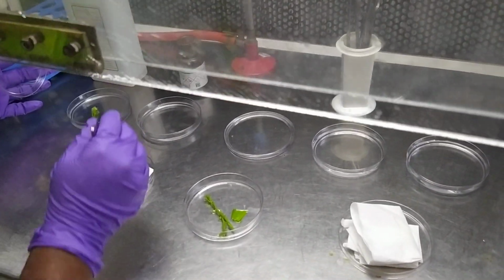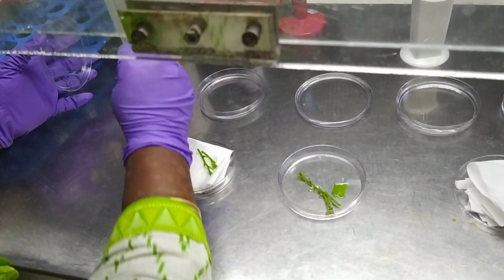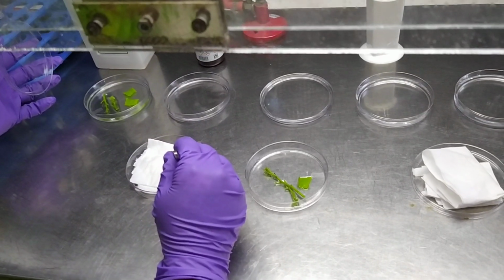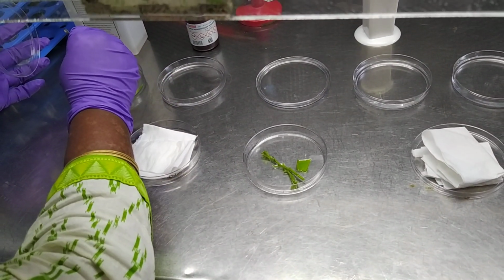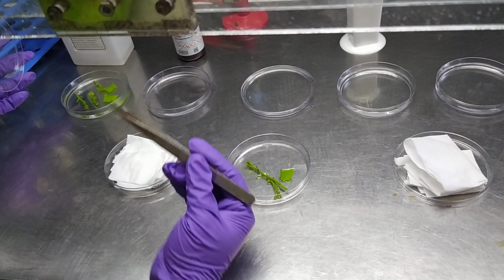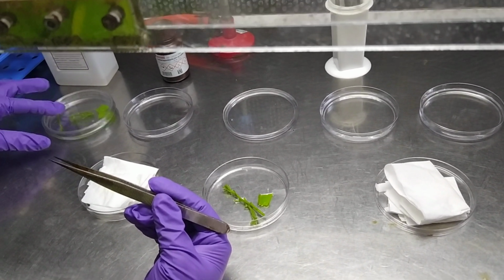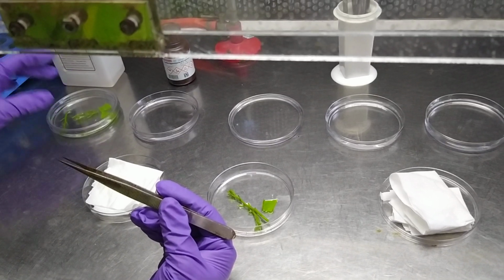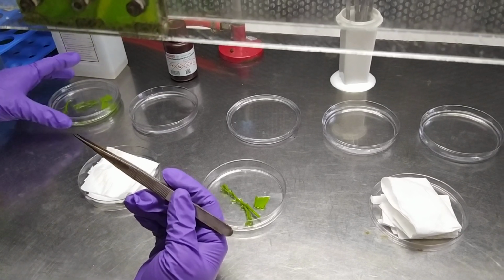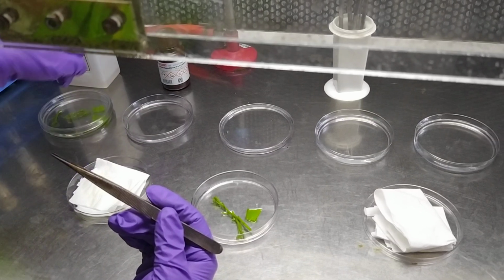I am doing it simultaneously for both direct and indirect organogenesis. The leaf bits we have cut, sterilized, and washed with Tween, I am immersing in alcohol. This is 70% ethanol, and the tissues have to stay in it for 1 minute. After 1 minute, the next plate is sodium hypochlorite.